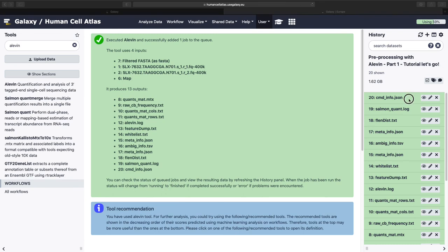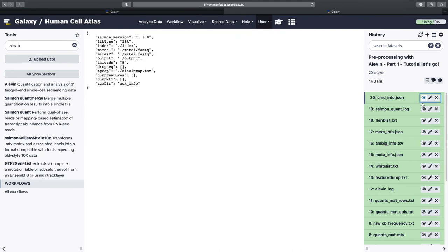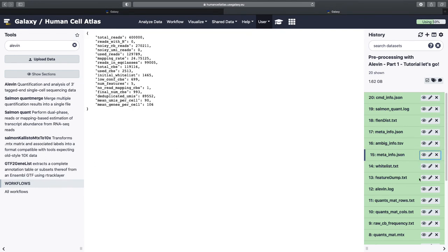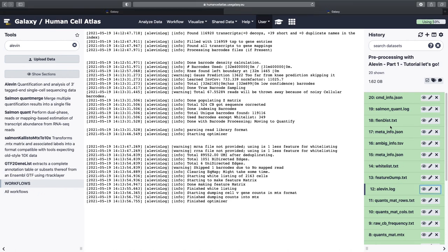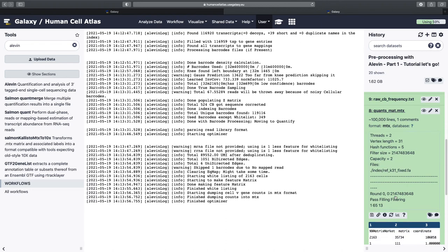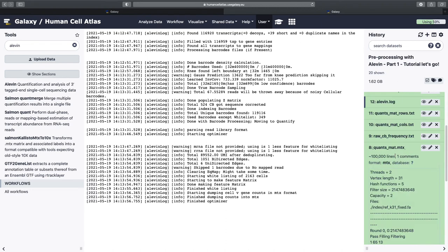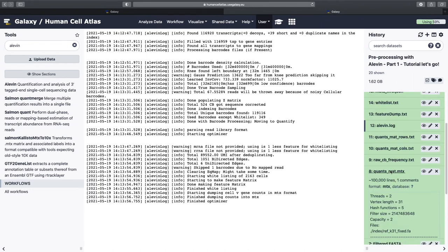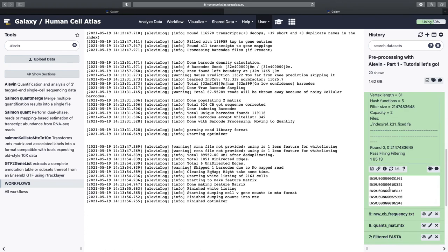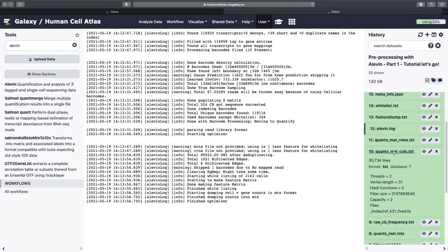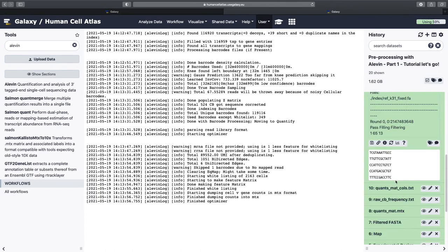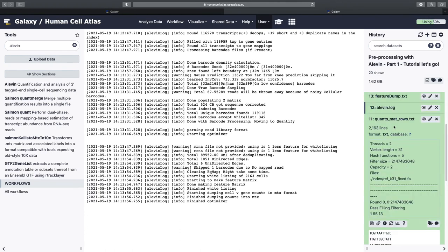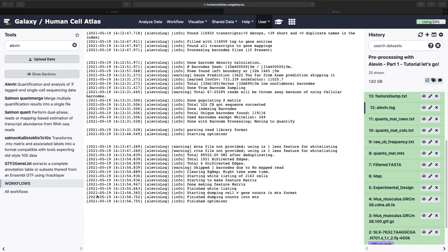And now we can look at different files. These are nice files. We can look at our matrix. Look at those numbers. Those numbers are important. And if you ever get kind of confused on what's what, it's helpful when you can look at the columns versus the rows and that's good information. And now we're going to make some droplet plots.